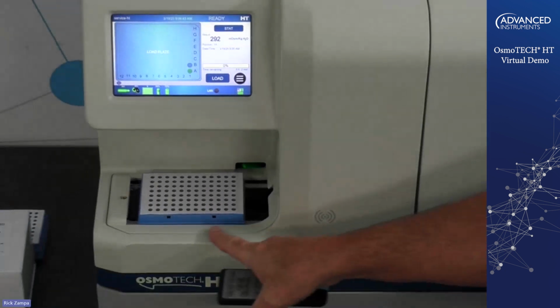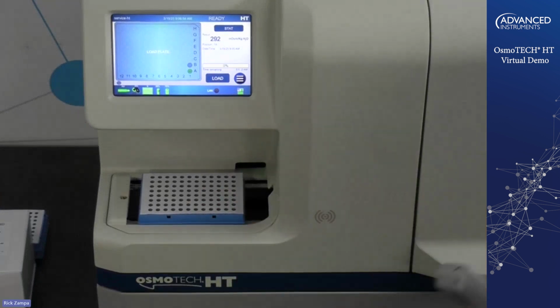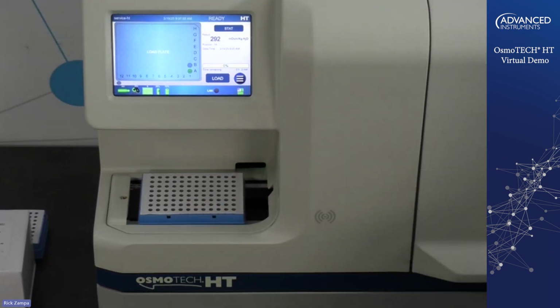So you see it brought the plate back out to the start position here so that now we can reuse the plate. You can remove that evaporation cover. That's why we give you extra evaporation covers. And you can then reload samples into the plate and start over again with that plate.